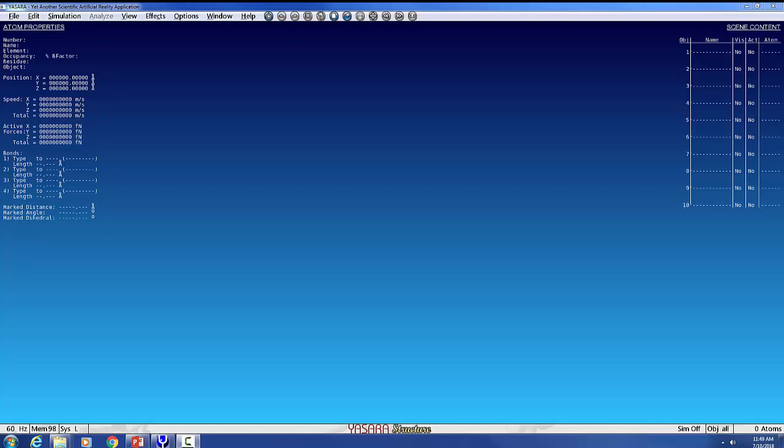All right, so this file is meant for a demonstration of the YASARA program that you will use to analyze protein structures. You'll get access to this YASARA program on either a server or one of the computers that we have here, but just as a reminder, this YASARA program is not meant to be copied, and so it needs to stay within the system.